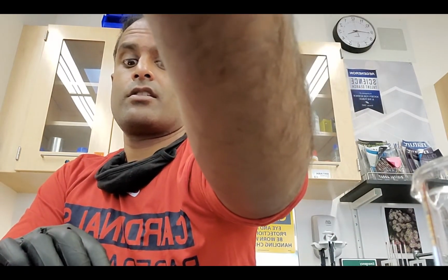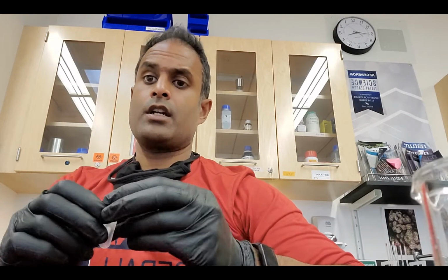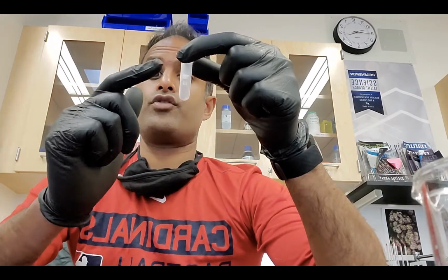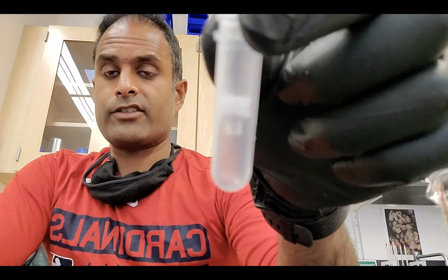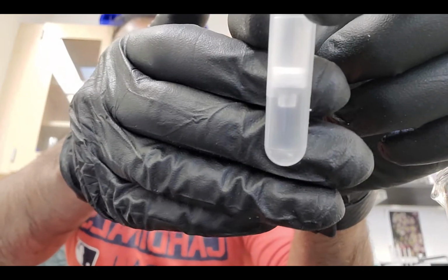Now I'm going to walk over to the centrifuge. And I'm going to follow the centrifugation step. After I use the tube for the first time, the DNA moves. The DNA has gone from my cells and into this white filter. Okay, so at this point, the liquid that's going through this thing becomes unimportant.